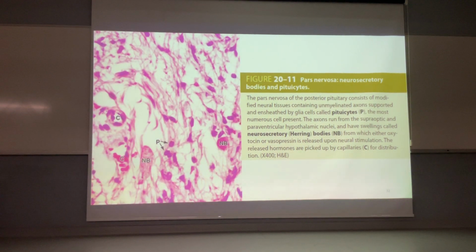Remember, I talked about the hormone transfers from the hypothalamus to the hypophysis with those tracts. In some parts of those tracts, hormones and their carrying proteins form swollen areas in the structure of axons. These swollen areas appear with this shape.